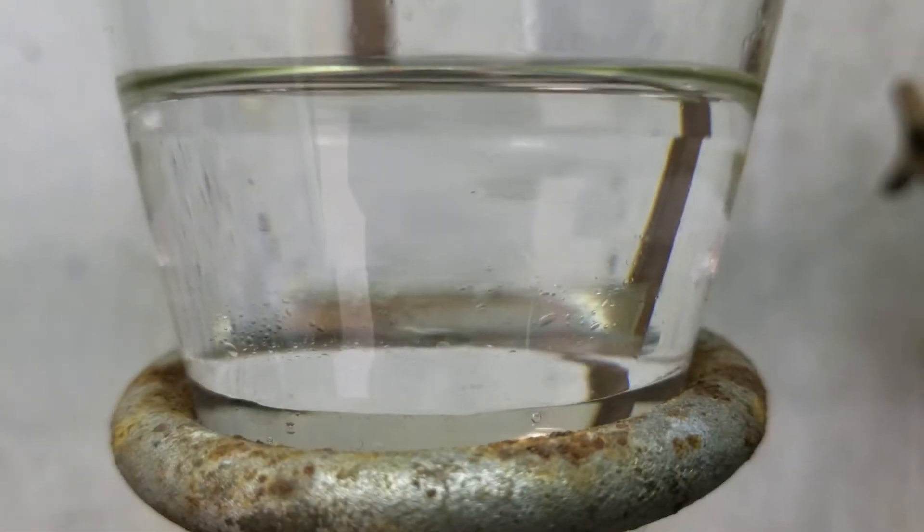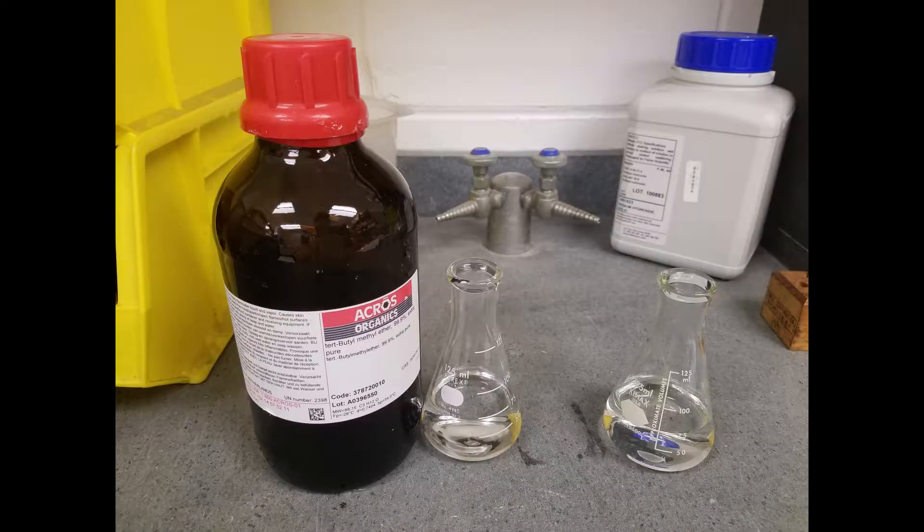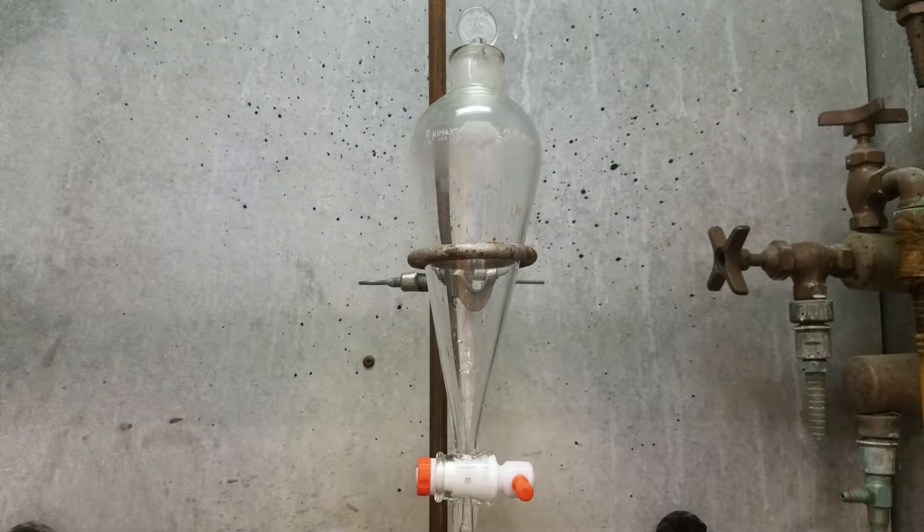Liquid-liquid extraction is an important purification technique in organic chemistry in which two immiscible solvents are needed. Methyl-tertbutyl ether and water are common solvents used in a liquid-liquid extraction. The extraction process takes place in a separatory funnel.